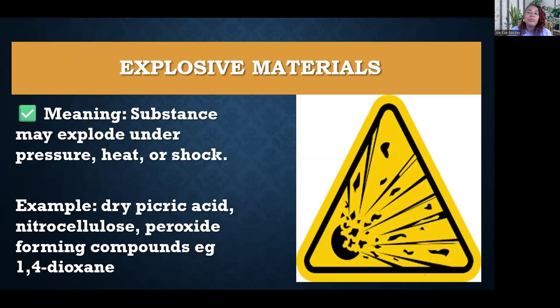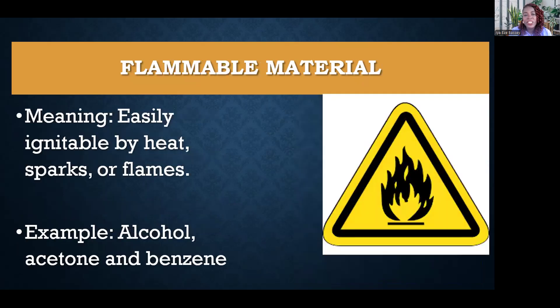The first symbol we're going to look at is explosive materials. It's a yellow symbol with an explosion in the middle, and it means that the substances within this area may explode under pressure, heat, or shock. For example, dry picric acid, nitrocellulose, and peroxide-forming compounds like 1,4-dioxane and others constitute materials or substances that are explosive in nature.